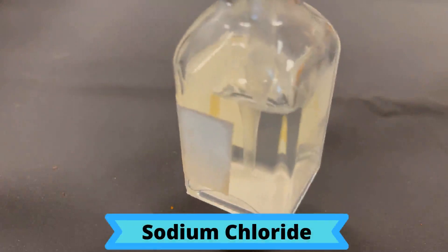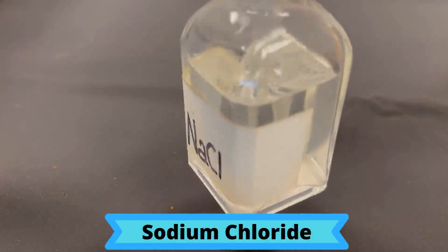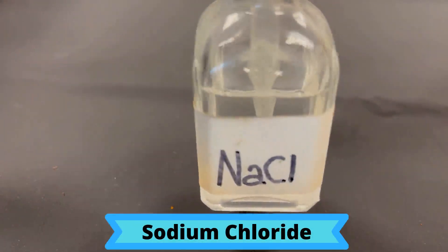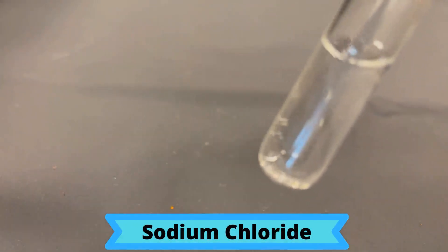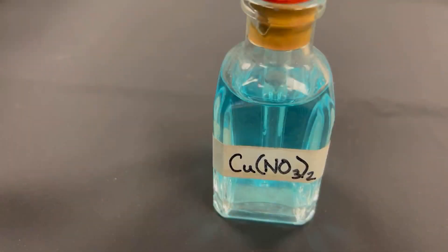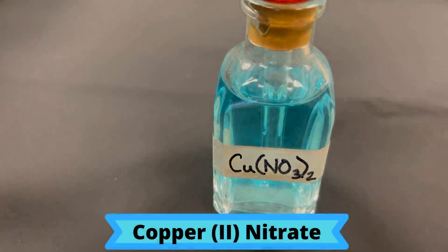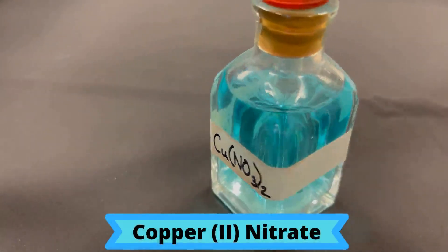Sodium chloride is a clear, colorless solution. It can also be referred to as salt water. Copper 2 nitrate is a clear solution with a bluish tint to it.